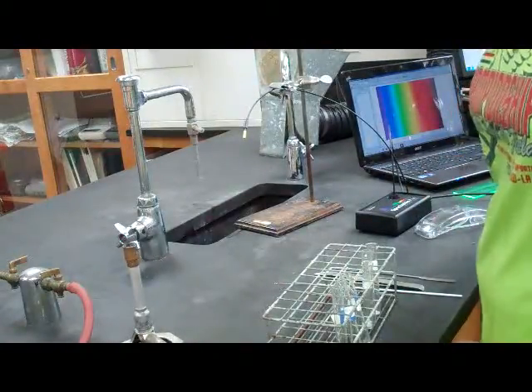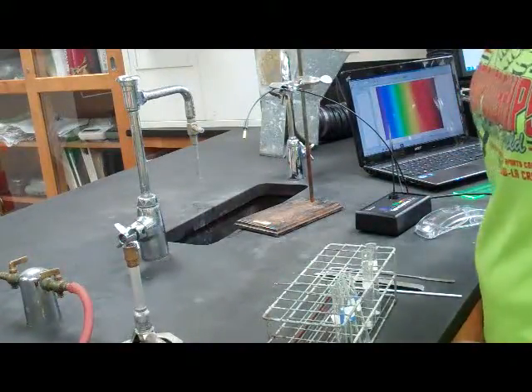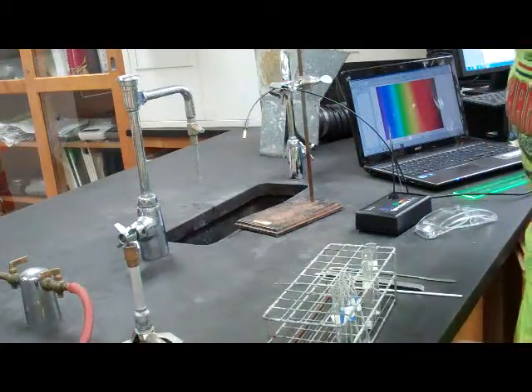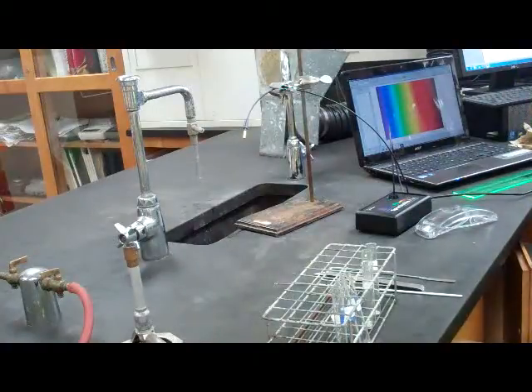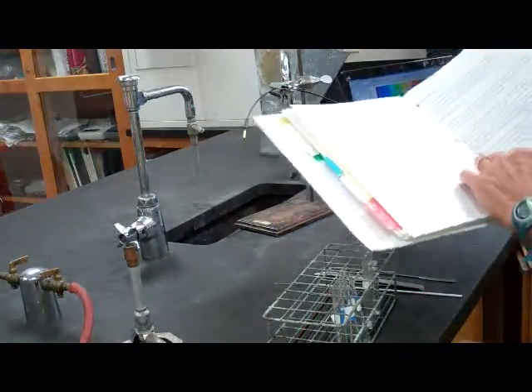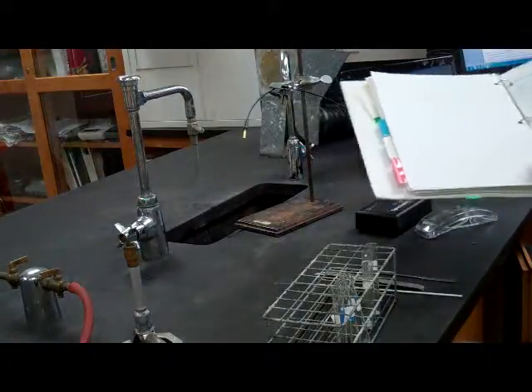Hello, we're here to start the Atomic and Molecular Spectrum Lab. We're working on Part A. Or Part B, the flame excitation of solids.